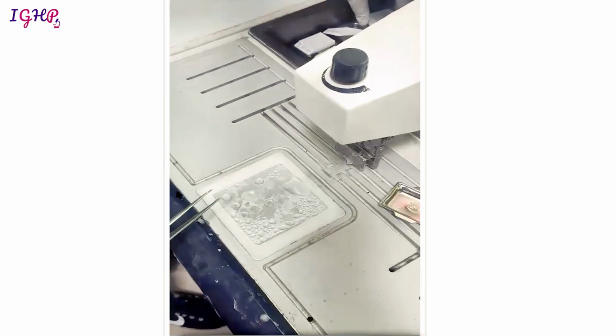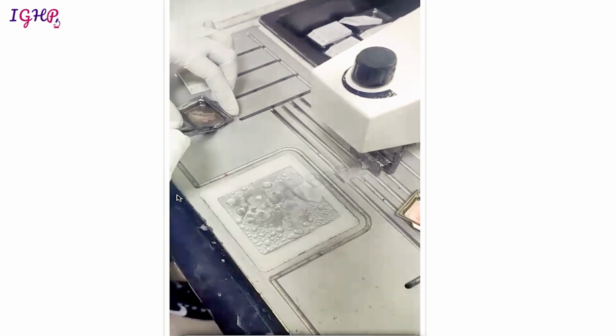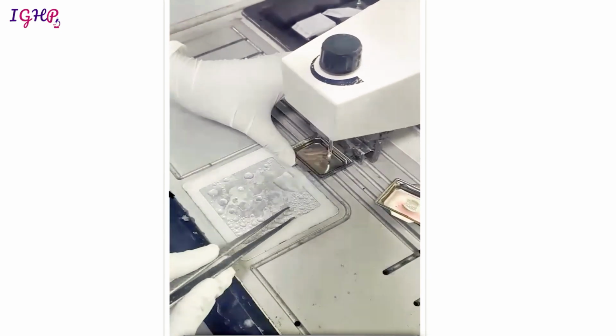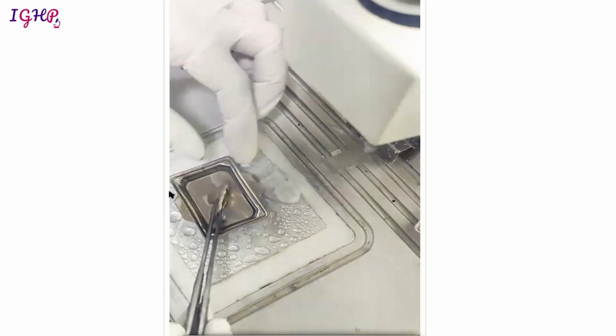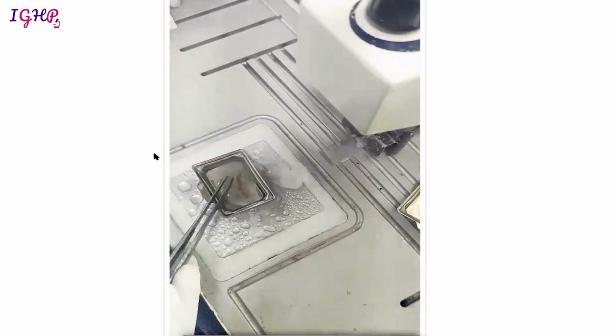So we will do it like this. The tissue is being taken out from the cassettes. Then we pour some wax in the mold, and this tissue is aligned on the bottom surface. We press it so that it comes near to the surface, the surface which will come near to the cutting surface of the microtome. So it will be a smooth alignment. We just press it a little, like we can see here.